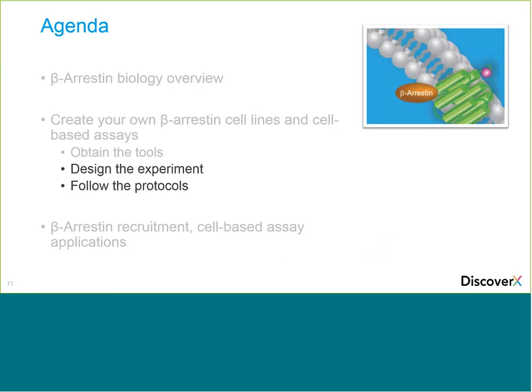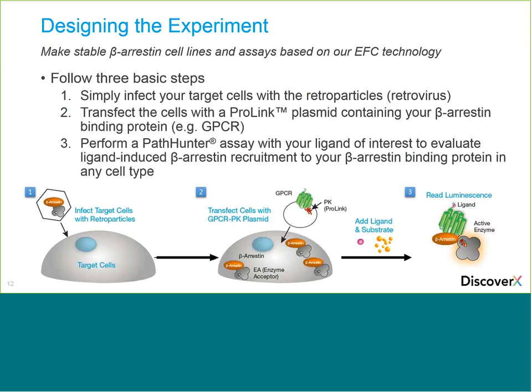So looking at the right, you're looking at an adrenergic receptor with a specific mutation, tryptophan to an alanine amino acid, and this causes the specific receptor to get stuck in the ER and not properly traffic to the membrane. So the goal of this experiment was to first rescue the GPCR using a pharmacological chaperone called propranolol.